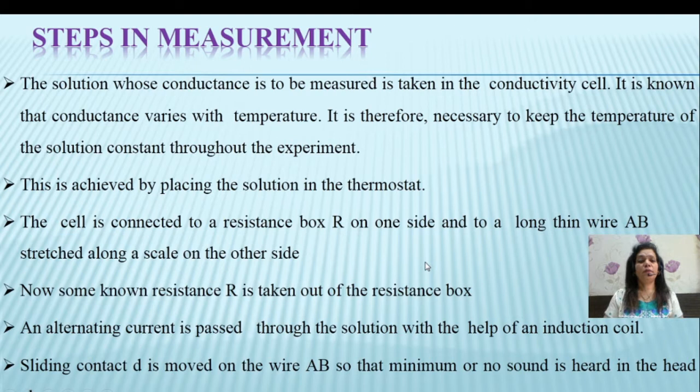When we are interested in measuring the conductance of a solution, the solution whose conductance we are interested in measuring is taken and placed in a conductivity cell. Here we need to maintain the temperature of the solution, so it has been kept in a thermostat to maintain the temperature of solution, as conductance depends upon temperature.